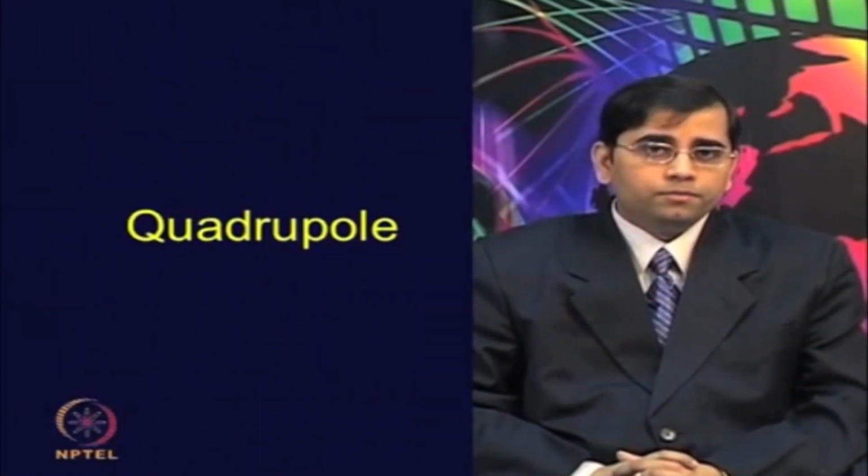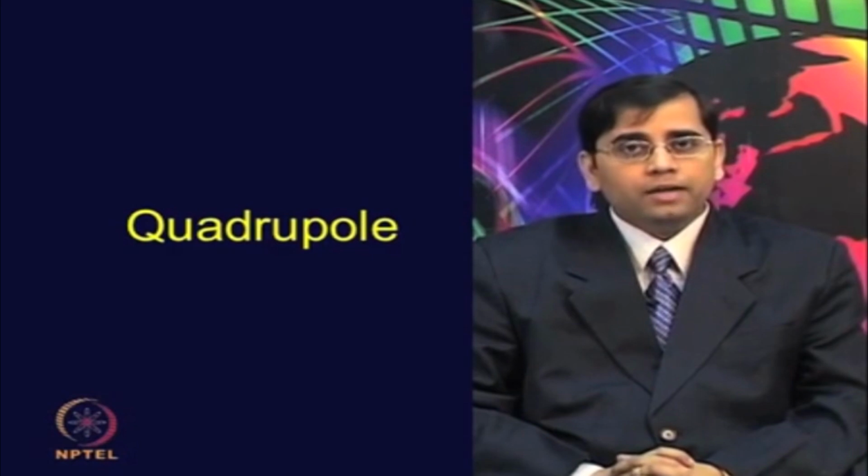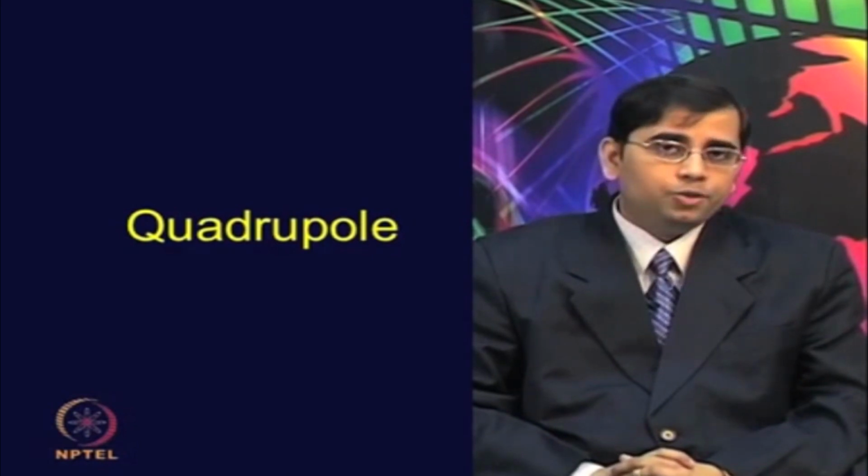Another commonly used mass analyzer is the quadrupole. The Q instruments are one of the most widely used types of mass analyzers currently used in proteomics.